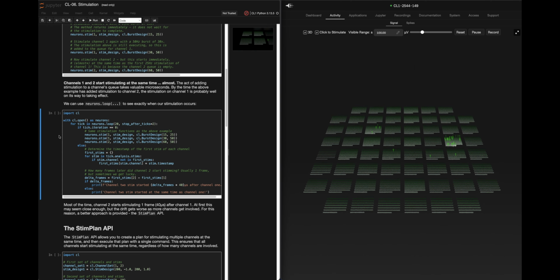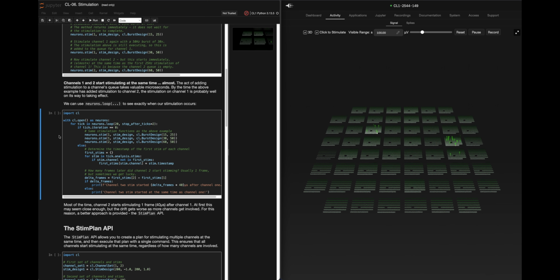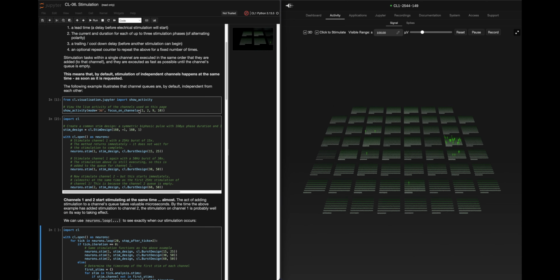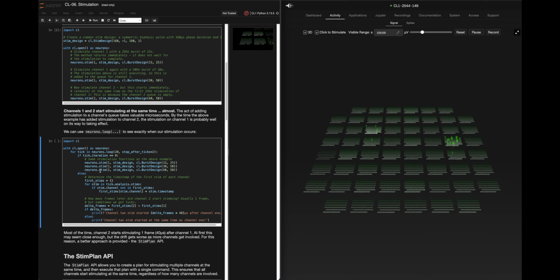They make all the difference. I found microseconds of latency, especially when you're recording data, are very important, and it makes the difference between being able to design a pattern that does something really well, and doesn't do anything at all. Just something to note, but that's very specialized, what I just said.